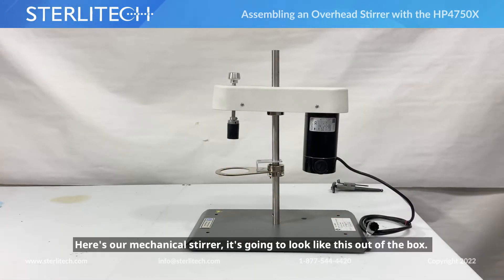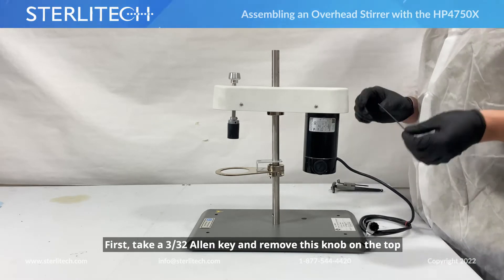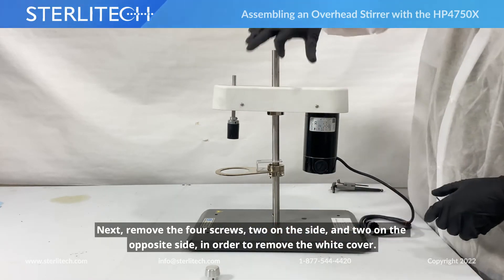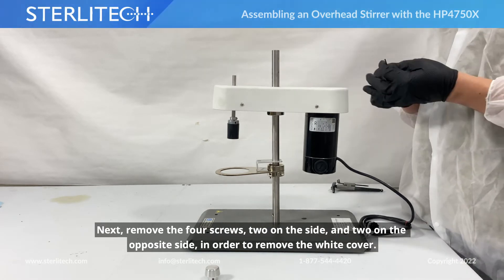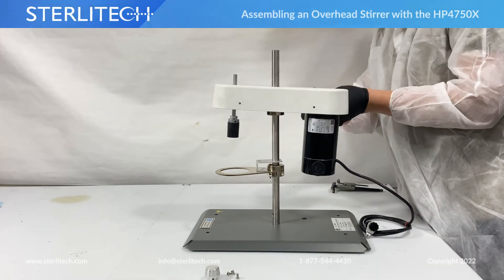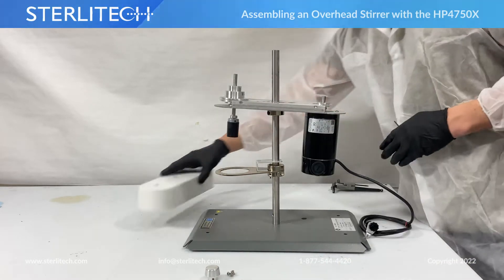Here's our mechanical stirrer — it's going to look like this out of the box. First thing we're going to do is take a 3/32" allen key and remove the knob on the top, set that to the side. Next we're going to remove four screws, two on this side and two on the opposite side, and remove the white cover.